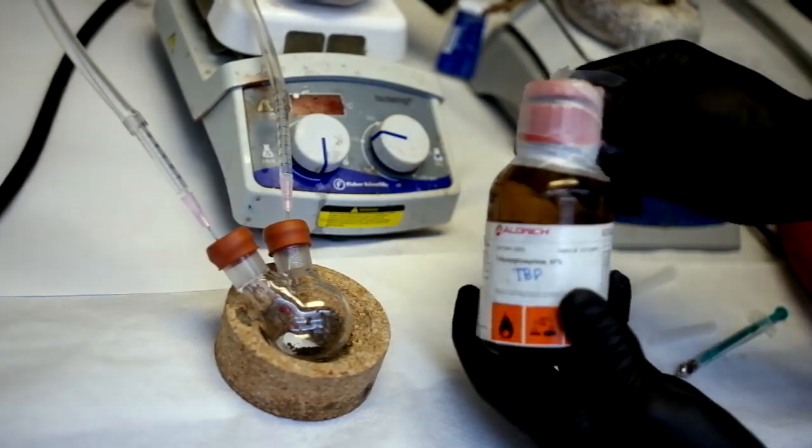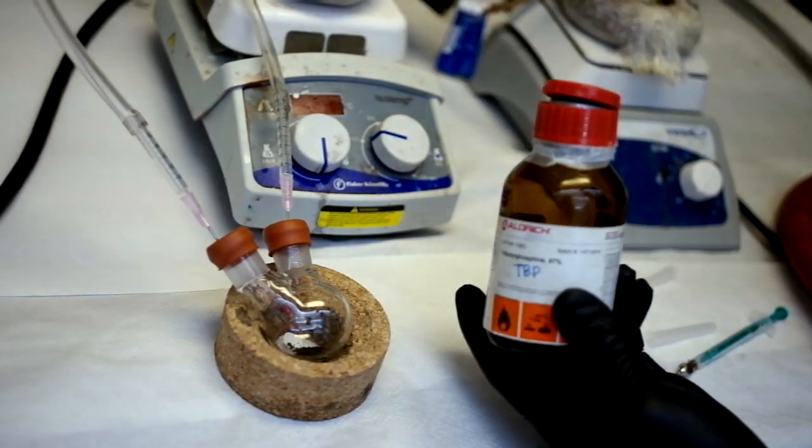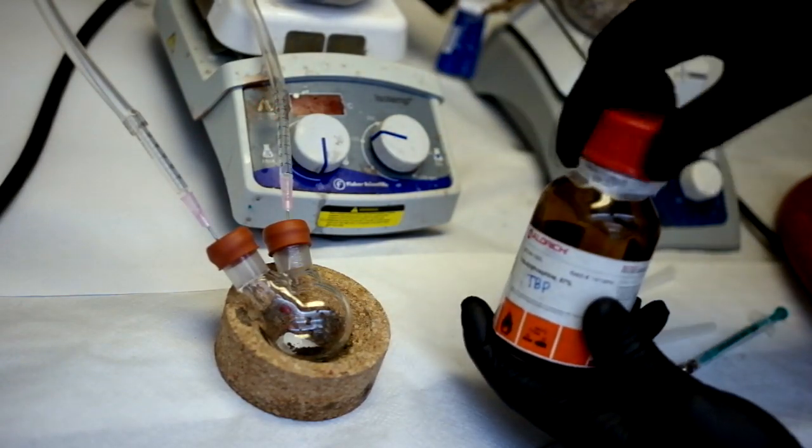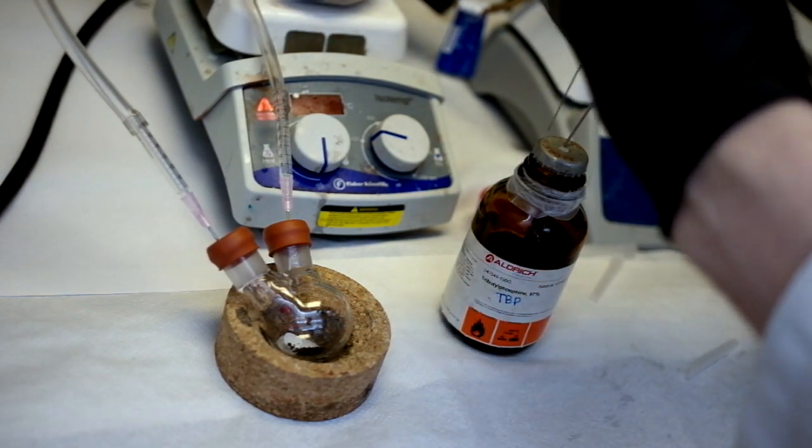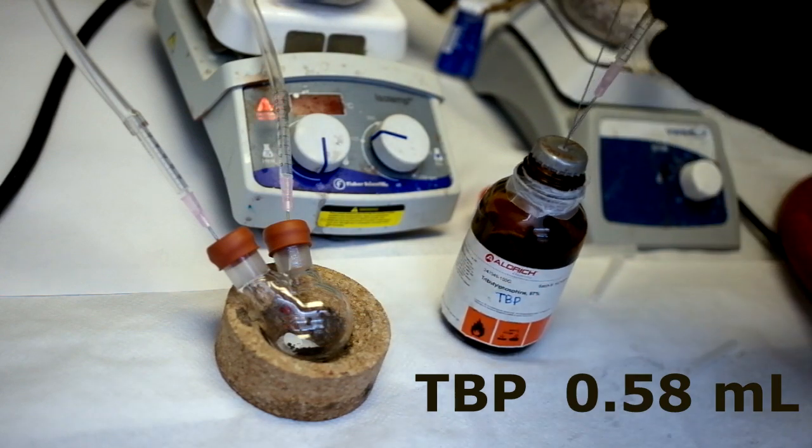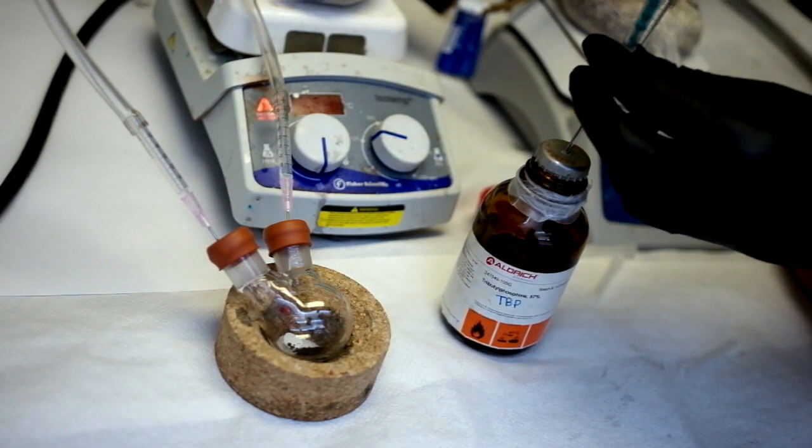Begin an argon flow in the selenium precursor flask. Underneath the fume hood, open up your TBP and insert an argon needle. With argon flowing, draw out 0.58 milliliters of TBP.